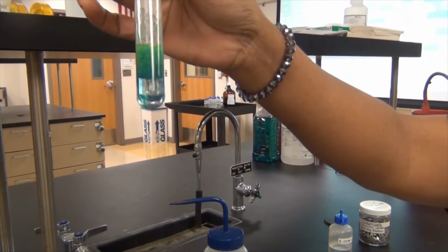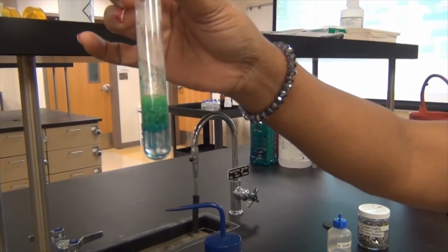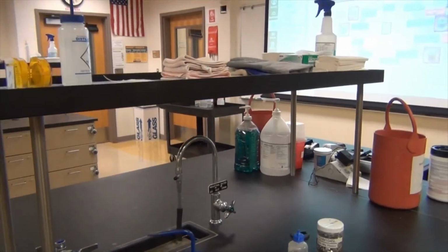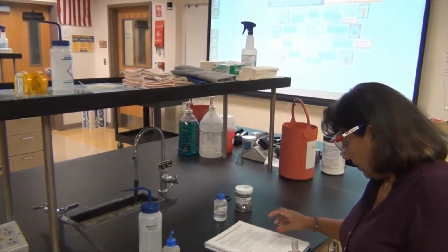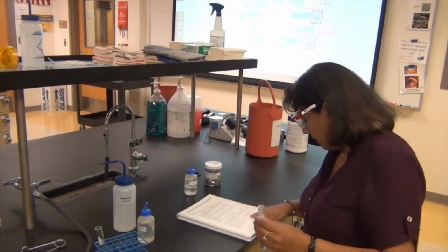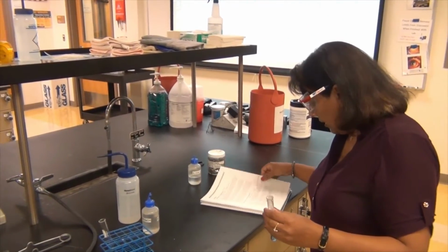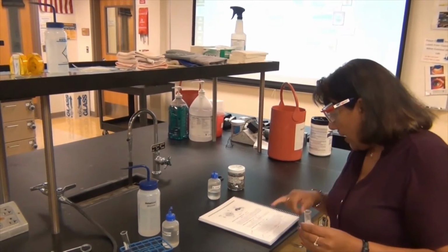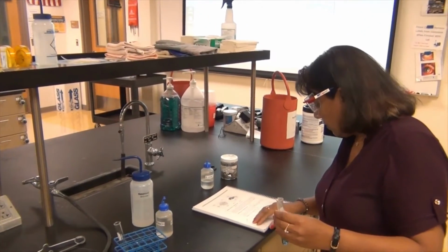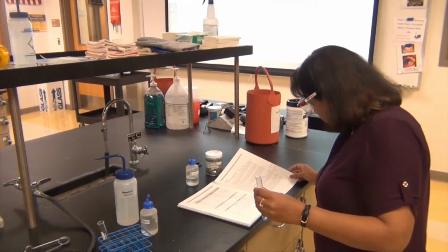Okay, so this was part B, of adding sodium hydroxide. Now I have to go to the centrifuge, but to go to the centrifuge, let me see if I have to add any water to this. I don't think so. Turns cloudy, and so on. And then, here we go, turn the page, and using a beaker to collect the waste. Okay, so here, add to centrifuge.